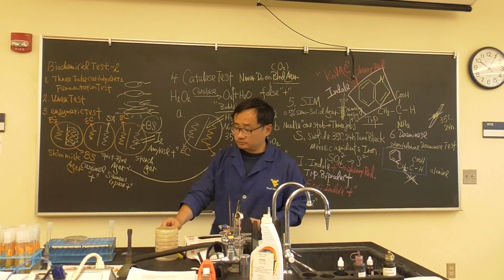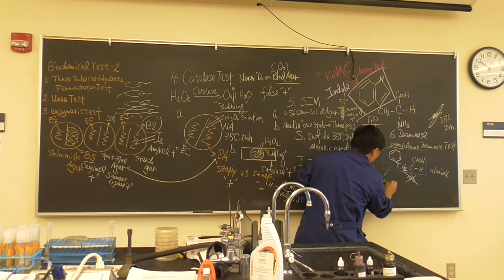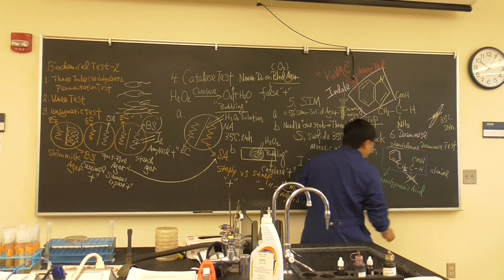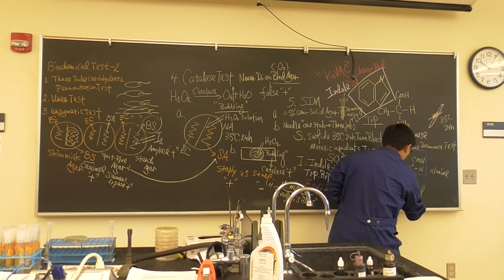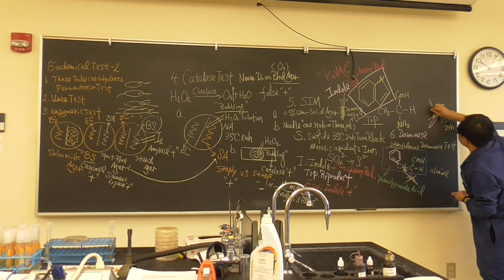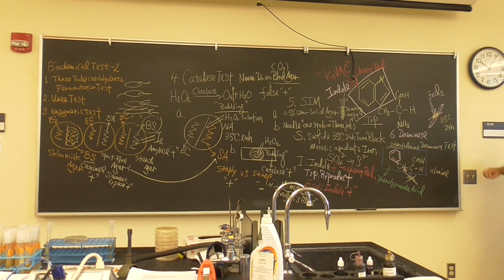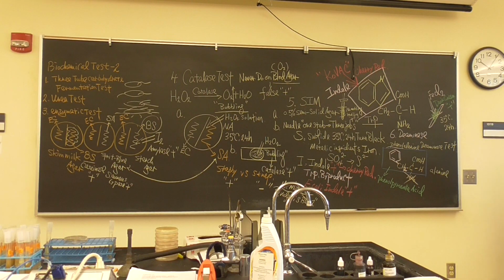Okay, what is this one called? We haven't talked about that, but you maybe know. This is phenylpyruvic acid or phenylpyruvate. Pyruvic acids. Now, why do I use green color? Because once you inoculate, we're going to add ferric chloride. If this one shows you dark green color, it is phenylalanine deaminase test positive.